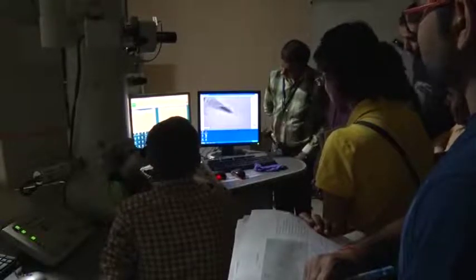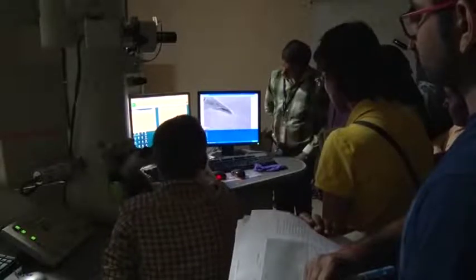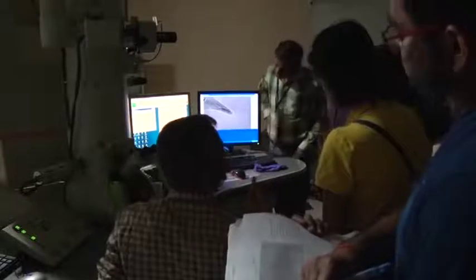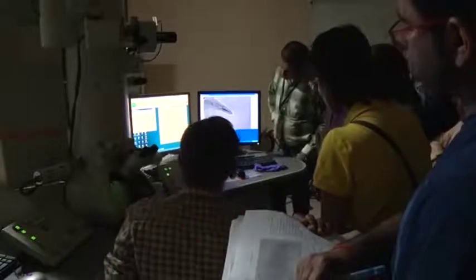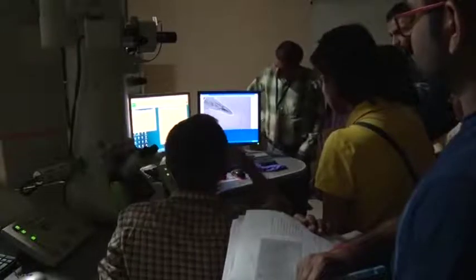So now we will try to minimize that, and these are the buttons, Z plus. So yeah, it has become slightly better. So I will do it a little more, and it is now much better, isn't it? And also the fringe has vanished. Correct? So I think we should be satisfied with that. So I removed that wobbler. So now it is like this. There is some faint fringe type of thing there.